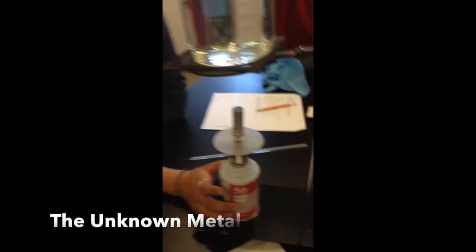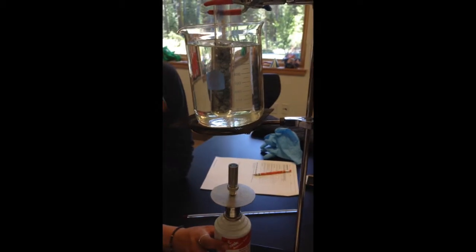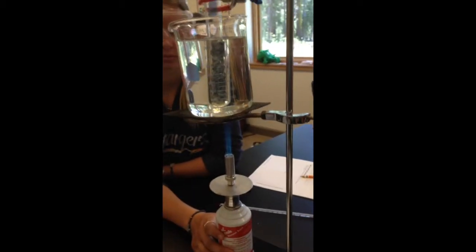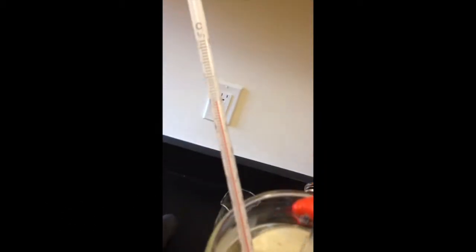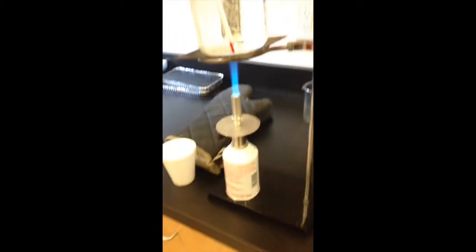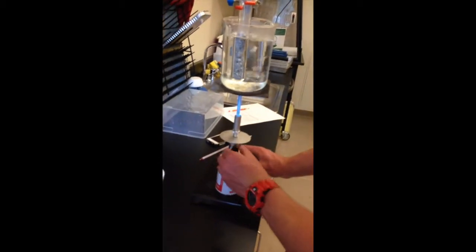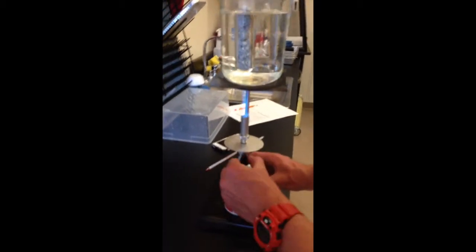Now we're starting our unknown metal. We've got a larger beaker because the metal is a lot larger this time. We're heating it now and it's taking a long time. We're still measuring the heat trying to get it to boiling. Now the mystery metal's water finally starts boiling, so we're turning off the flame. We're going to dump the hot water in the sink and pour the mystery metal into the calorimeter to check its specific heat.